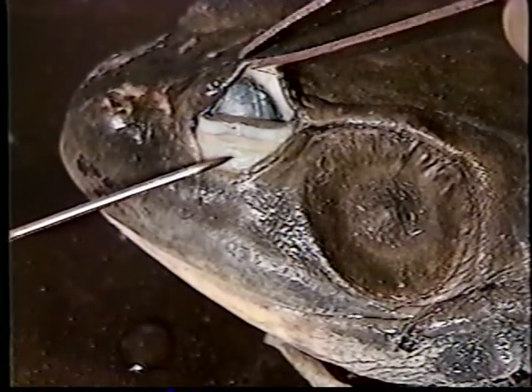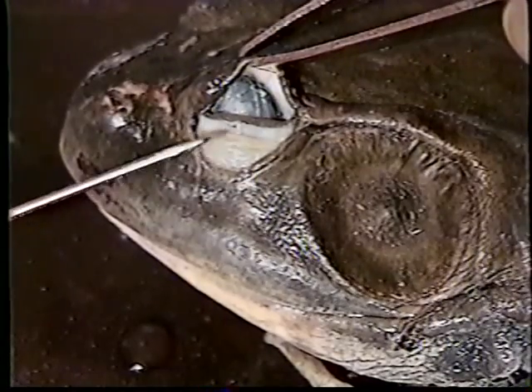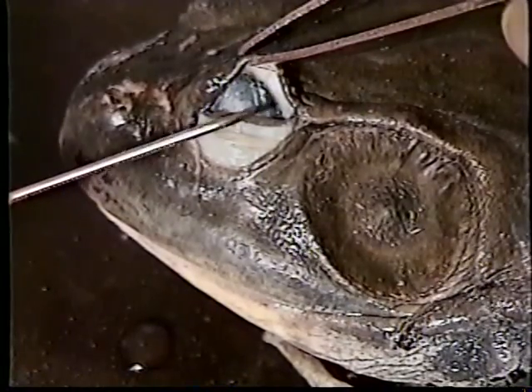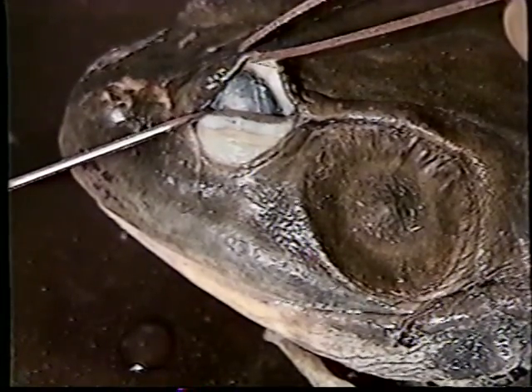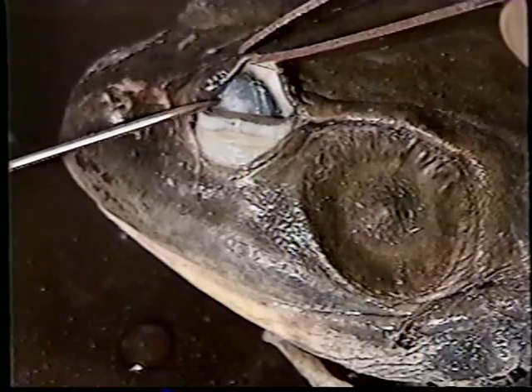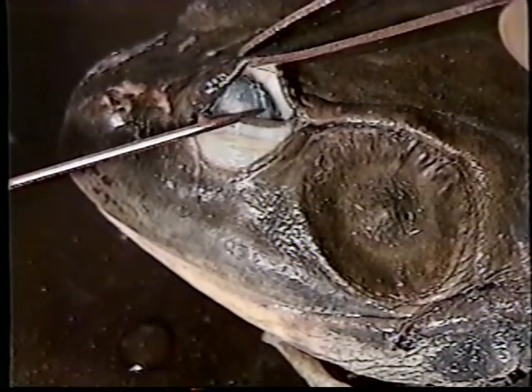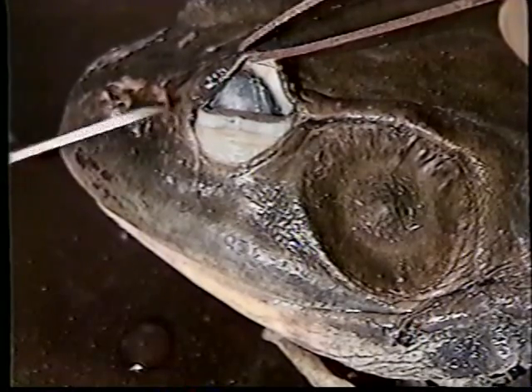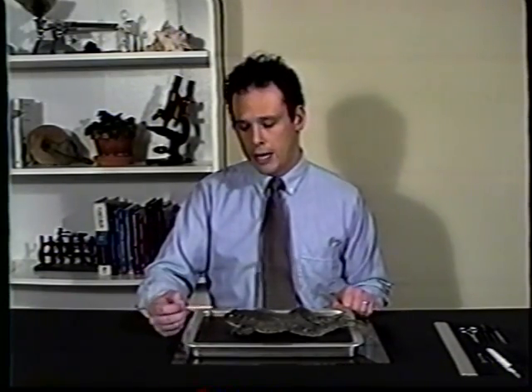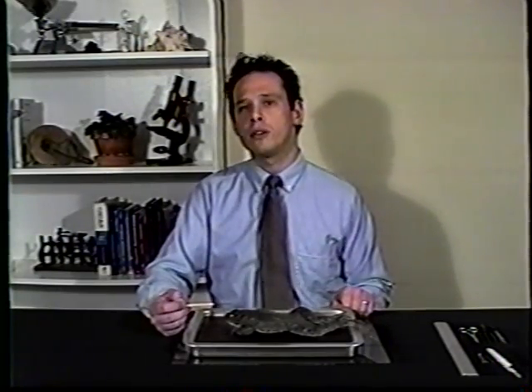As we examine the eyelids of our frog more closely, we can see that by pulling back the upper eyelid, we get a clear look at the bottom eyelid. This line represents the top of the bottom eyelid. In between, we see the third transparent eyelid that protects the eyeball of our specimen. This transparent eyelid is used primarily when the frog is underwater. It covers the eye and works similar to the way a pair of goggles would work on you while swimming. This serves as protection for the eyeball.